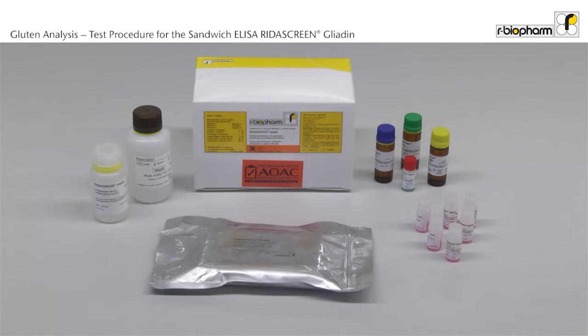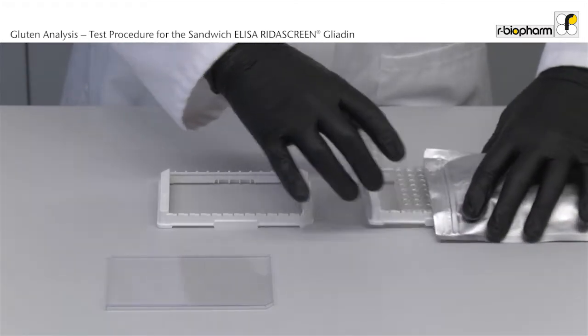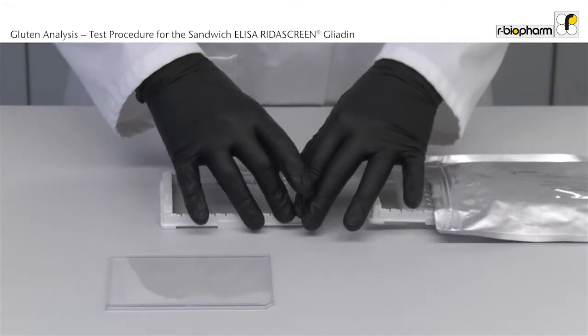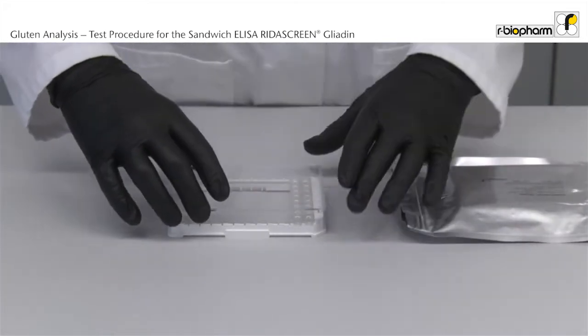RIDAS Green Gliadin contains all reagents to carry out the test procedure. Unpack the bottles and the microwell plate from the box to bring all reagents to room temperature before use. This takes about 60 minutes. After an hour, open the aluminum bag and insert a sufficient number of strips into the microwell holder. Leave unused strips in the aluminum bag so that the strips are not exposed.